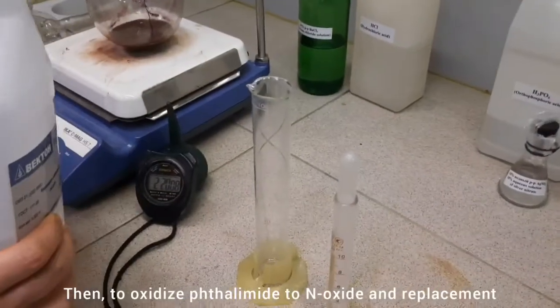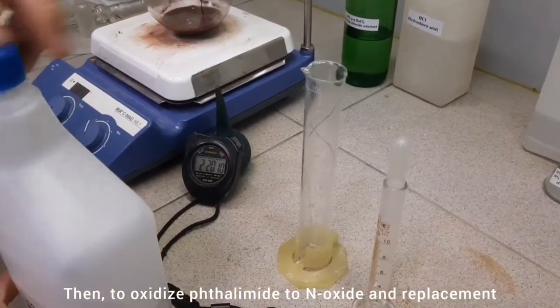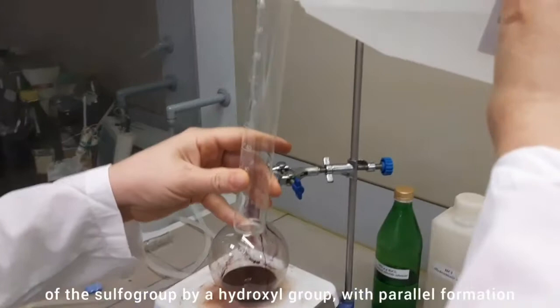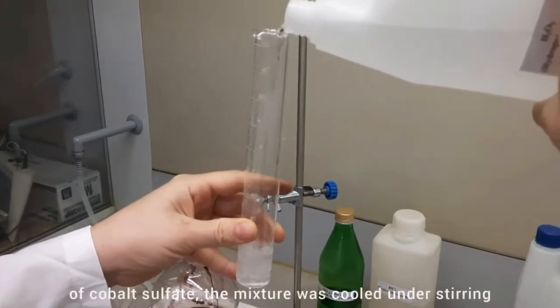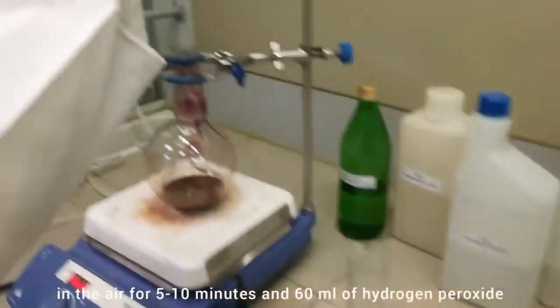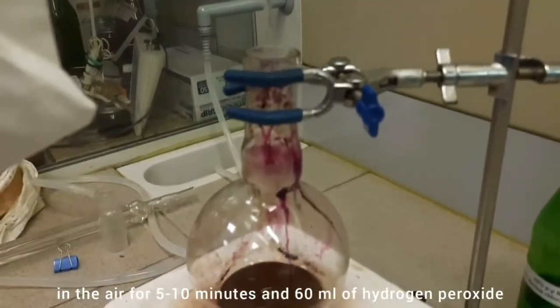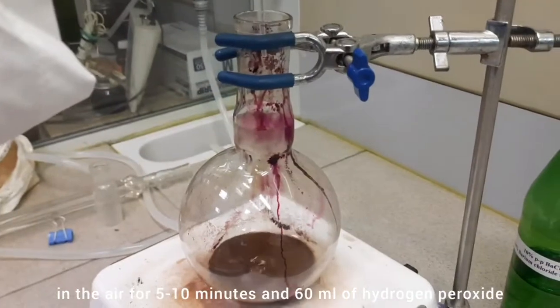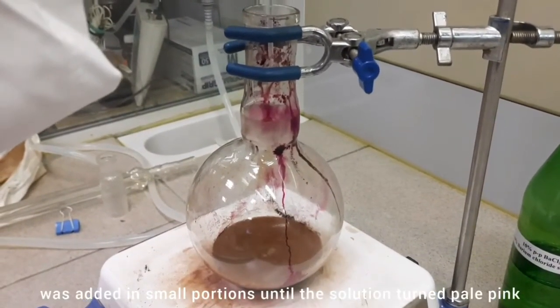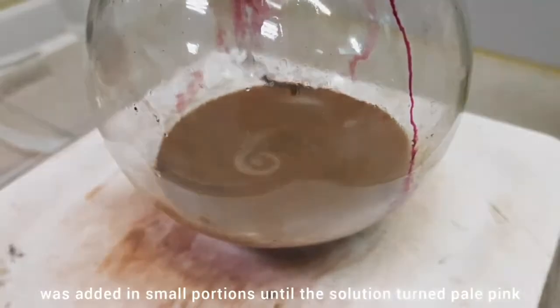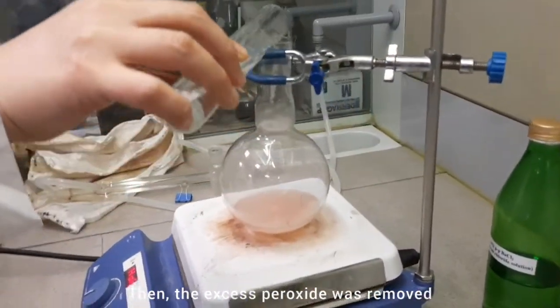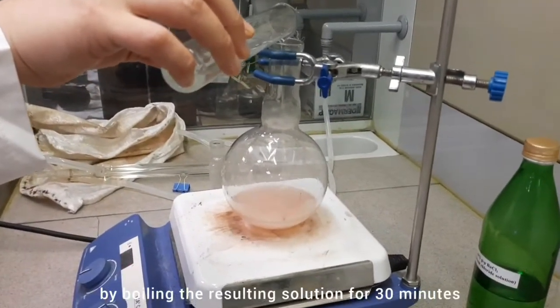Then to oxidize phthalimide to N-oxide and replacement of the sulfur group by a hydroxyl group with parallel formation of cobalt sulfate, the mixture was cooled under stirring in air for 5 to 10 minutes, and 60 ml of hydrogen peroxide was added in small portions until the solution turned pale pink. Then the excess peroxide was removed by boiling the resulting solution for 30 minutes.